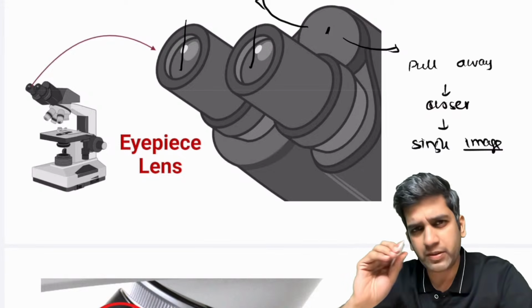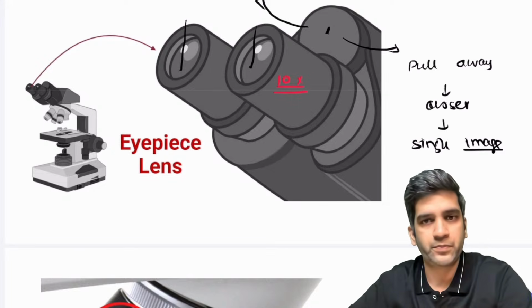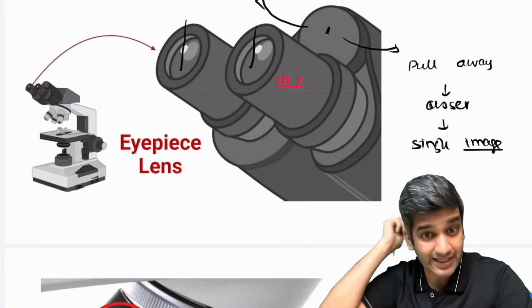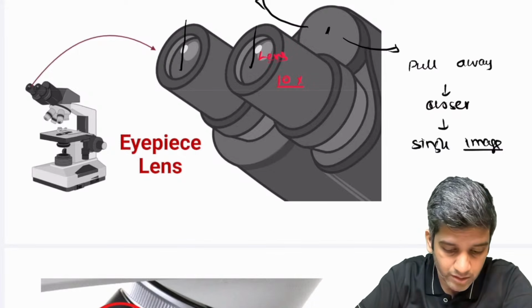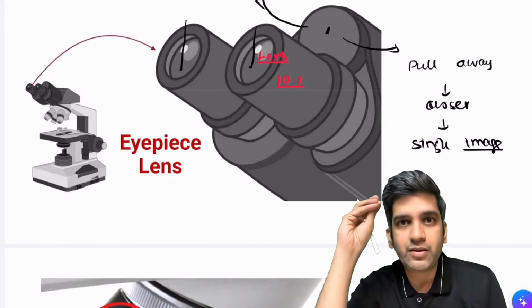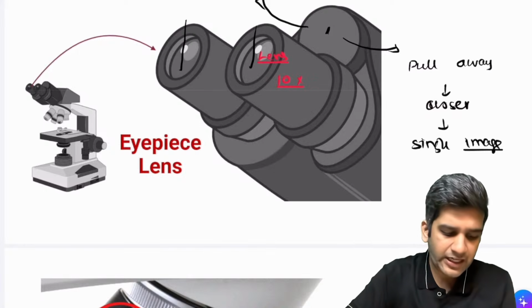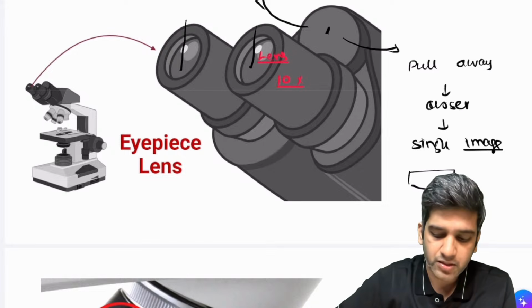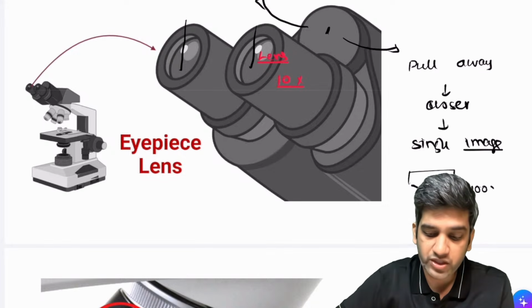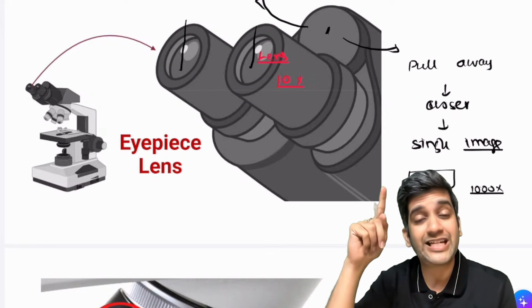Generally, most of the microscopes, this also has a magnification of 10x, right? It's a 10x magnification, okay? 10 times it magnifies. It has a lens here. The lens gives a 10x magnification, right? Why this is important is, when you see Robbins images, or when you see any pathology textbook images, it will be written microscopic image of 400x magnification or 1000x magnification. How do I come to 400? For that, this 10 is very, very important, right?